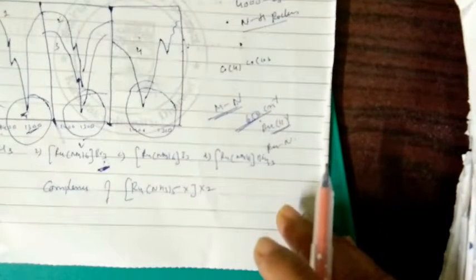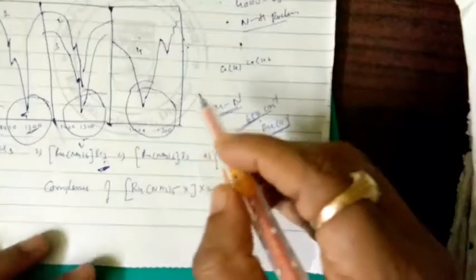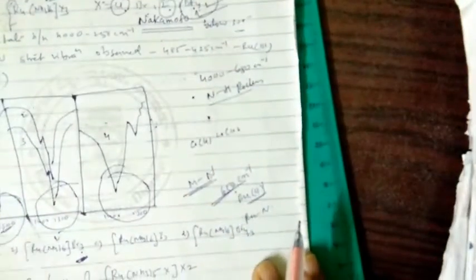But they were not observed for the fluoroborate BF4 complex.